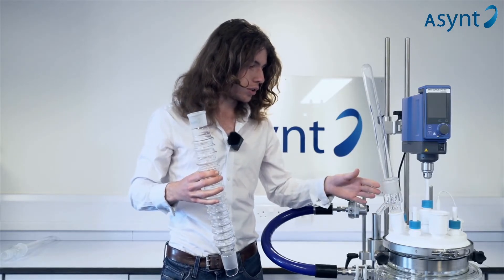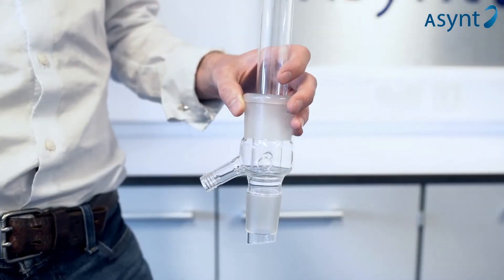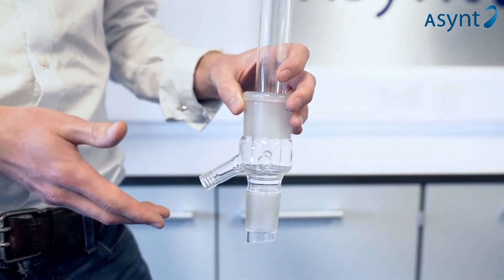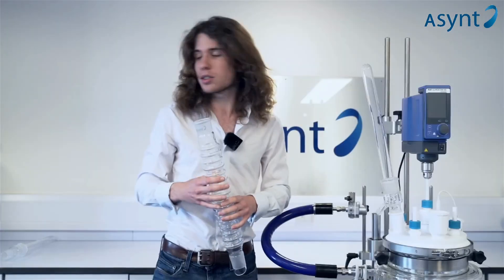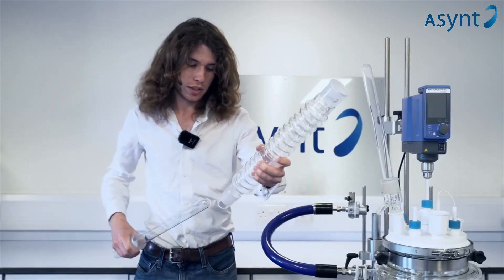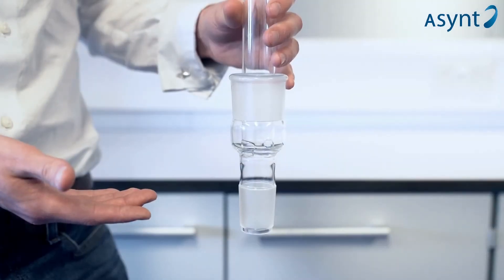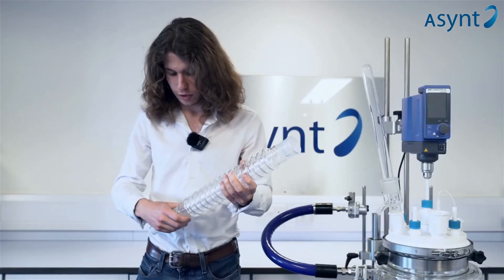There are two types of inner layer. There's this one here for distillation, which has a GL side fitting for siphoning off any products. And then we have the reflux inner. This fits in just the same, so they're interchangeable. This one is more specialized and more efficient for reflux reactions.